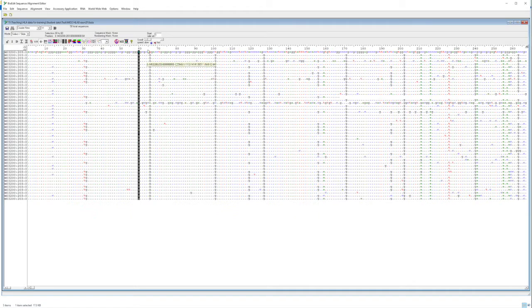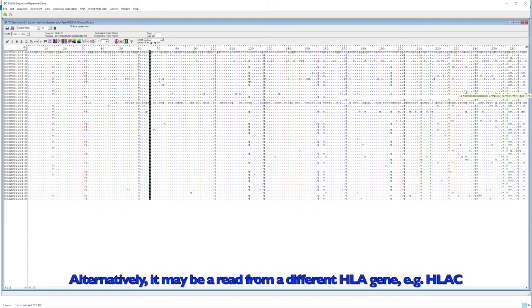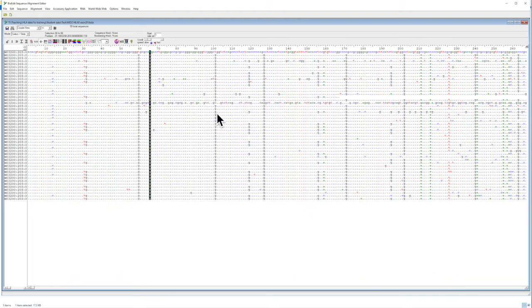And similarly in this position here we have 48 Gs reported and only 1 T and 1 A, so again it should have been a G. So this sequence that we've chosen as the master sequence actually has quite a few substitution errors in it as we look across the page, where it just basically disagrees with almost every other sequence.